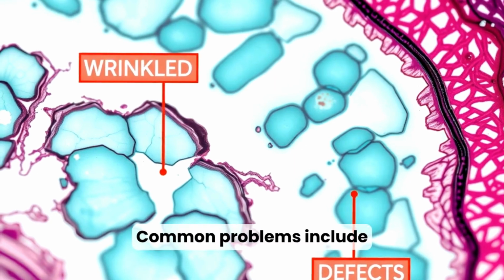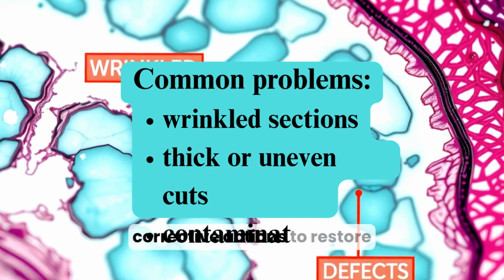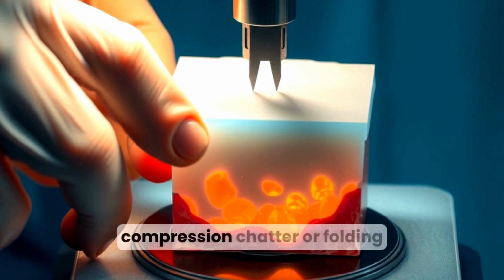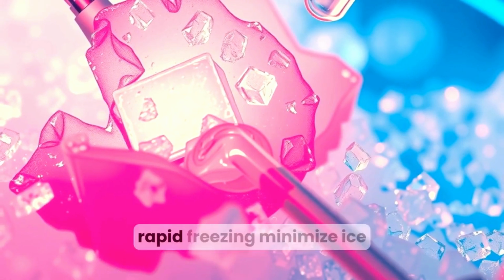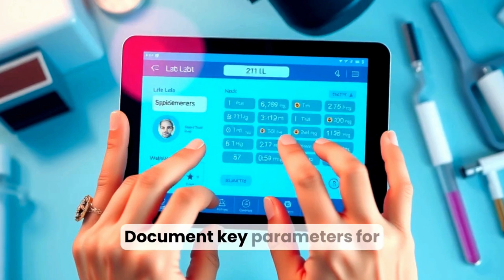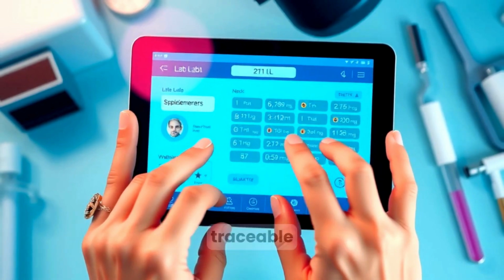Common problems include wrinkled sections, thick or uneven cuts, or contamination. Each issue has specific corrective actions to restore quality. Adjust blade angle, cooling methods, trimming technique, and section thickness to address compression, chatter, or folding artifacts. For frozen sections, ensure rapid freezing, minimize ice crystal formation, and maintain cryostat cleanliness to preserve morphology. Document key parameters for each specimen: thickness, blade type, temperature, and cutting speed, so results are reproducible and issues traceable.